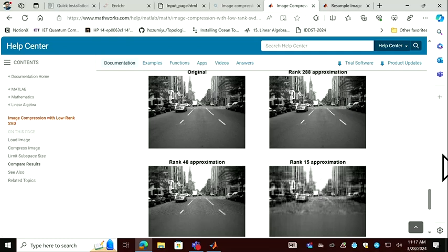We have no idea at which level to stop when you do this denoising. If you over smooth your data, maybe it looks good, but you lose the biological variability. Yeah, we don't know.